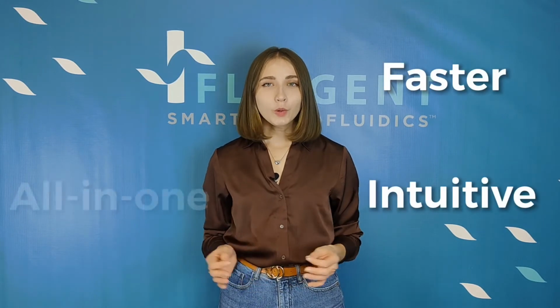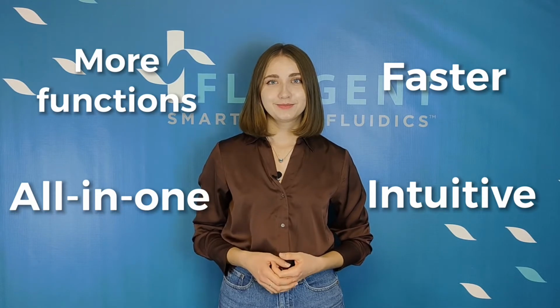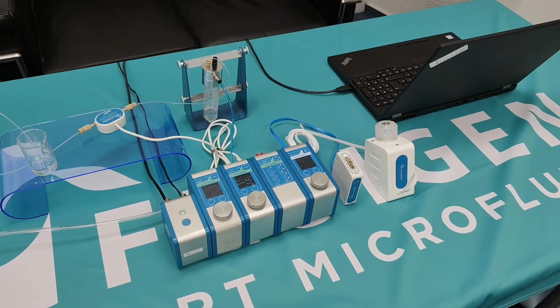OxyGEN was created to give you a faster, intuitive, all-in-one place solution with more functions for your microfluidic tasks. There is a variety of things you can do with OxyGEN, but let's stick to two topics in this video for starters. First, I will give you a general overview of the interface using a simulated system. Second, I will show you how to control the devices in real time. By the end of this video, you will be all set to proceed with your own microfluidic experiment.